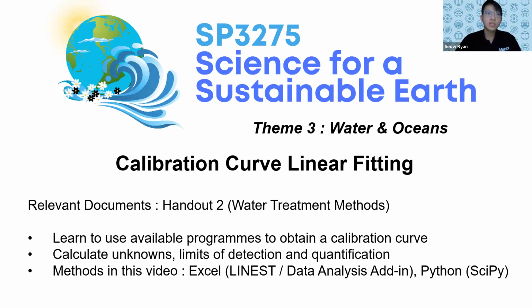So this video is just here to teach you how to use programs that are available to you to obtain a calibration curve based on data that you already have. In this handout, of course, we will give you the data so that you can try to create your own calibration curve. But during the experiment, you'll be collecting your own data to create your own calibration curve.